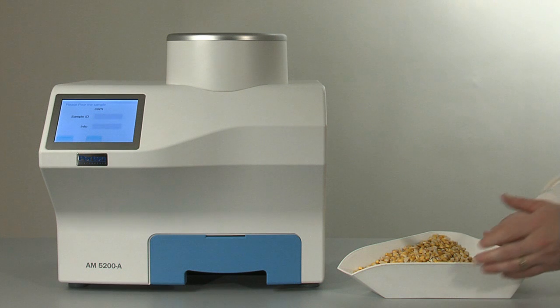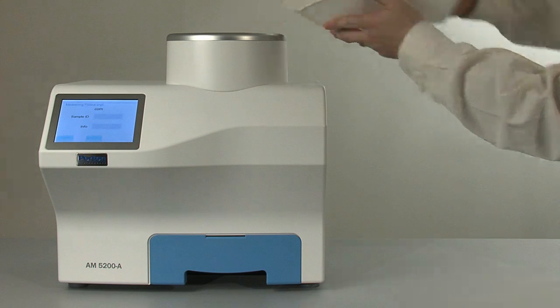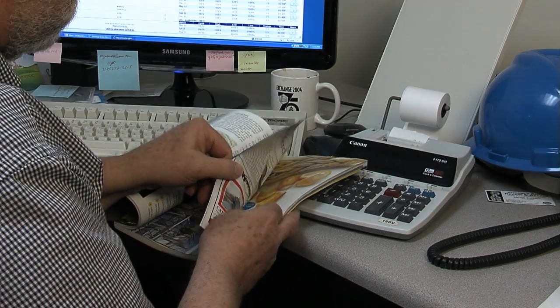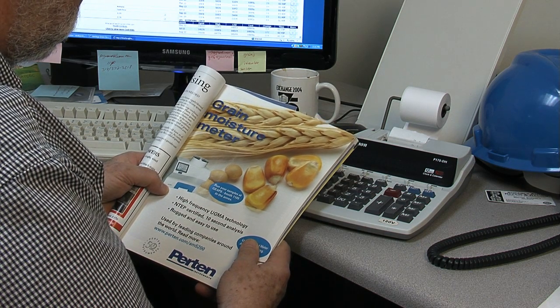With its quality, simplicity, ruggedness, and superior support, you will also want a Perten AM5200A for every one of your grain transactions. But it's reasonable to ask, why buy a Perten? And we have some very good reasons why you should buy a Perten.